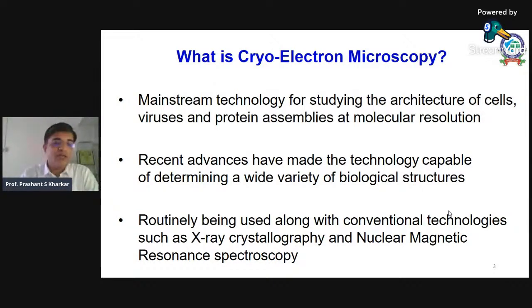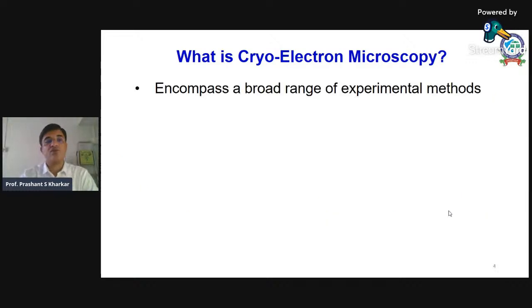So what I'm trying to tell you is the importance of being able to determine the 3D structure, which is central to structural biology as well as the basic sciences, and that's exactly why we are talking about cryo-electron microscopy.